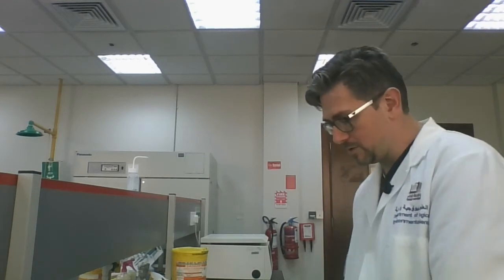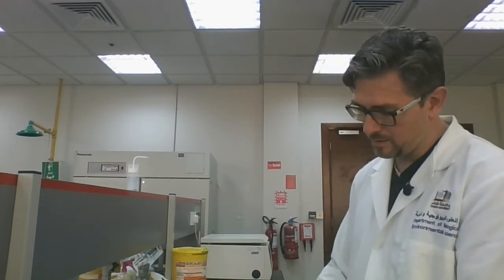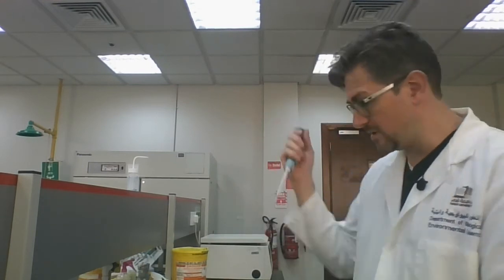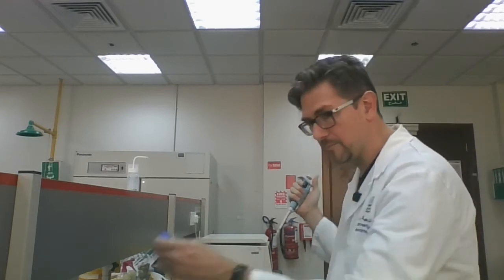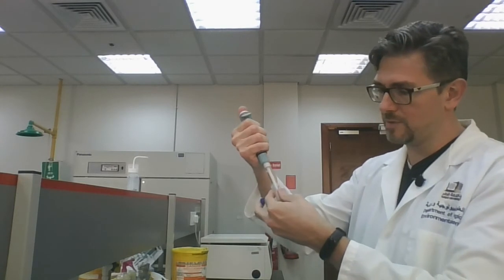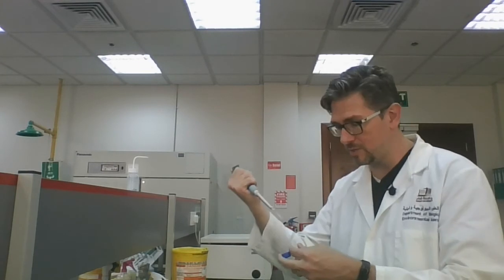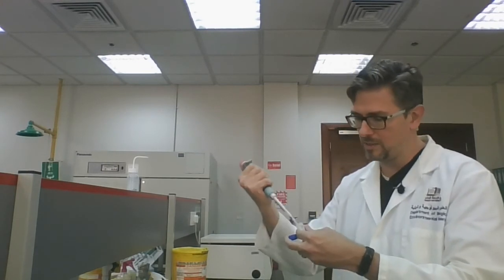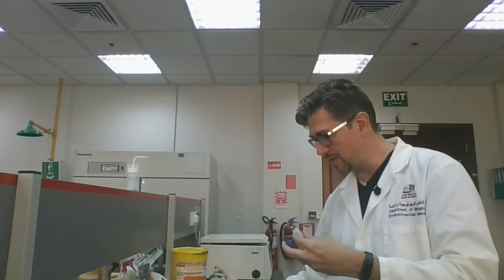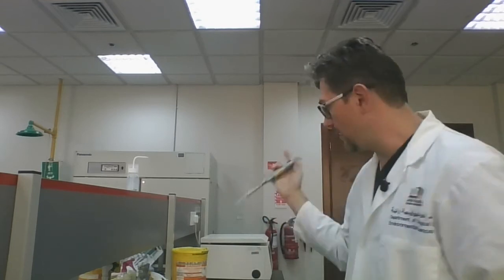So with a P200, I'm going to use yellow pipette tips. So I'm going to use the smaller pipette tips. I should have opened this box earlier. And tap it on, pipette tips on nice and tight. I'm going to take solution A, and I'm going to pipette 100 microliters into the first epi tube. I'm not touching anything with the micropipetter tip, so I can just use the same tip again. If you touched anything, get a new tip. But if you haven't, then just go ahead and use the same tip to pipette the same solution into both tubes. Now I can get rid of the tip.